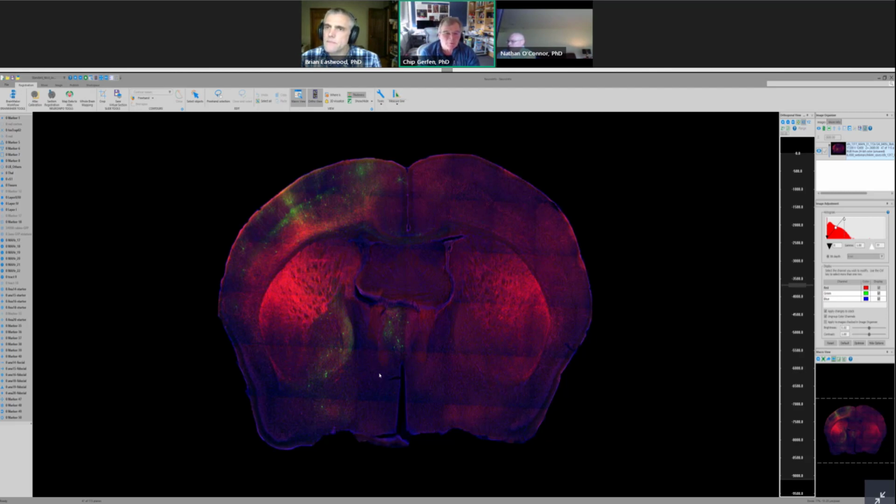Sometimes, depending on the microscope, it doesn't get the whole section, but what we found is you just use what you can get. It'd be nice to have all of them perfect, but they're not always perfect. However, I will say it's much better to do multiple focal planes than a single focal plane. Okay, that's kind of what I was getting at.